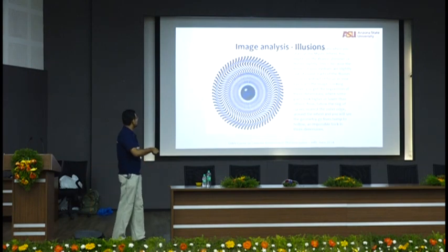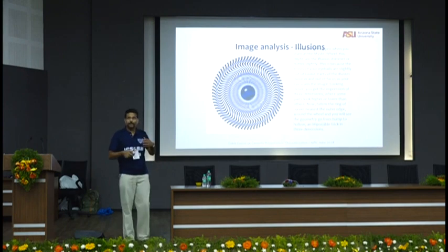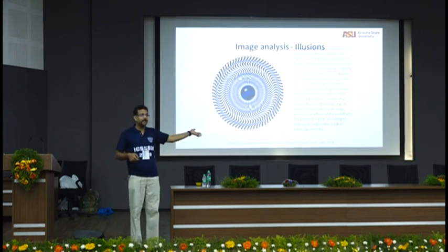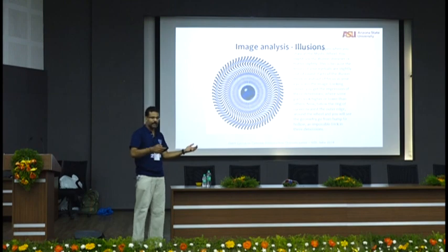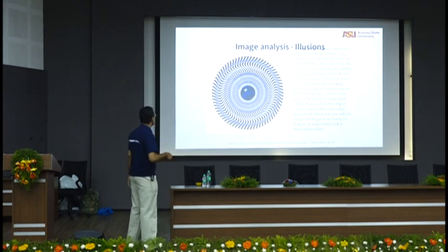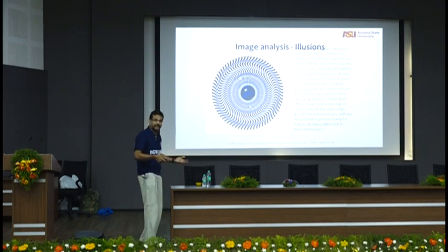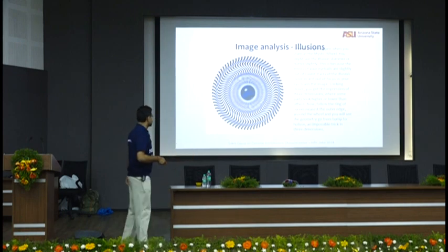As your eye scans the image, looking closer, you will get a 3D impression. You can see that, right? You can feel that this is deeper and this is on the surface, right? But do I have a real 3D image? No. That's what you're getting in a secondary SEM. Don't you see that your calcium hydroxide is higher, the cement paste is lower? You see that, right? But that's because you have a secondary image and you don't really have 3D. You're seeing in 2D still, but our eyes can perceive 3D even in 2D.